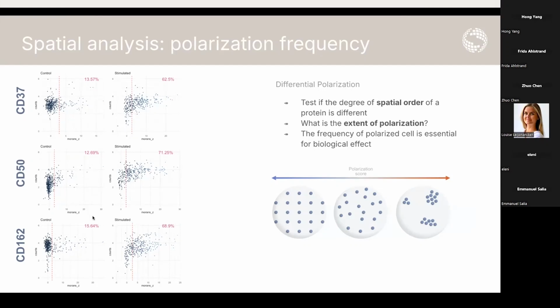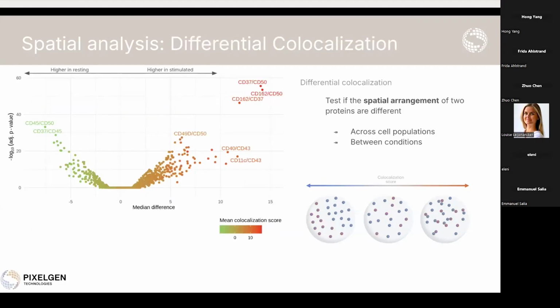However, after the stimulation, we see that that increases to 60 to 70%. So that is a dramatic increase in the polarization of these cells.